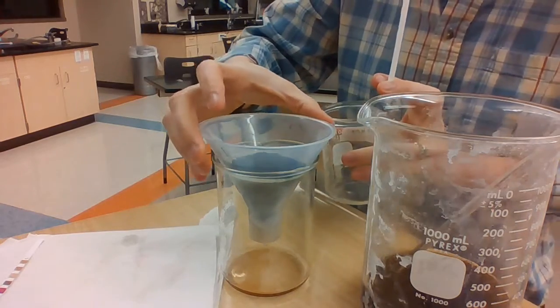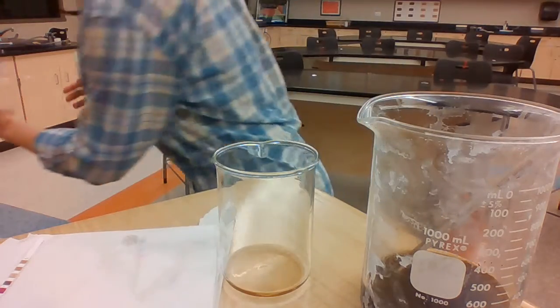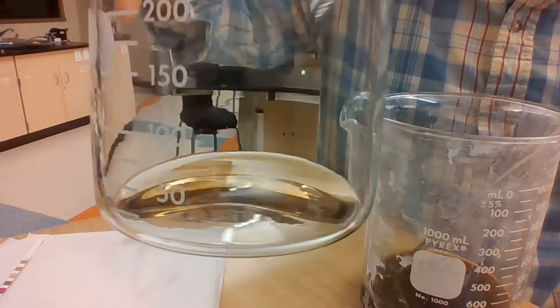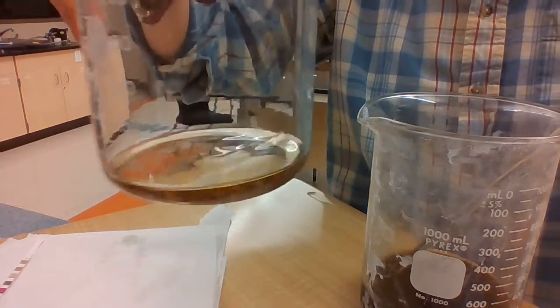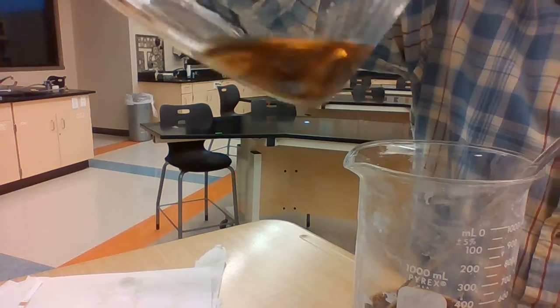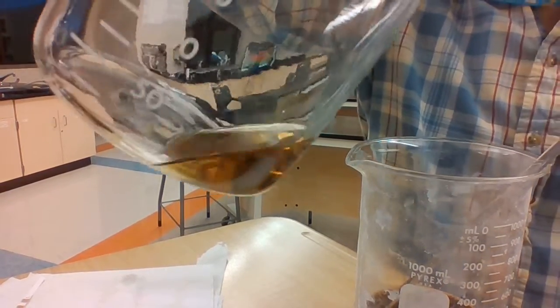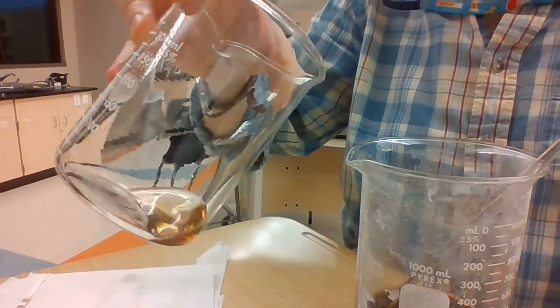I'm just going to take my filter out, put it into another beaker, and put that aside. Now if you look at the filtered water, let's see if I can get that somewhere where you can see it. Describe that. Hopefully you can tell that it's definitely clearer than it was. For clarity, it still has some brownish color to it, a little gold hue, but it's definitely more transparent. So that's an improvement visually.